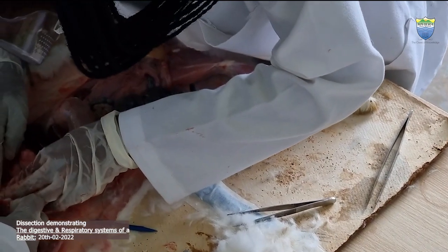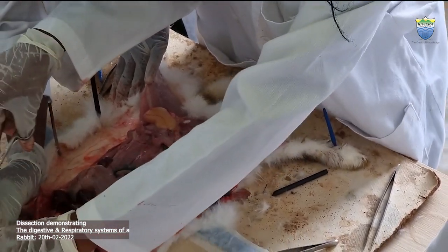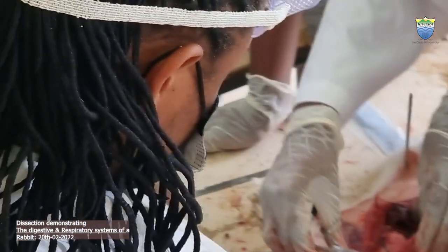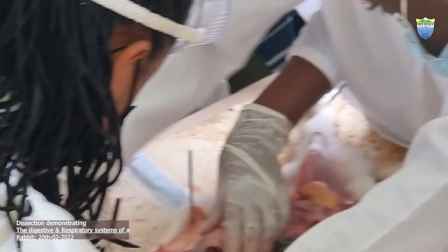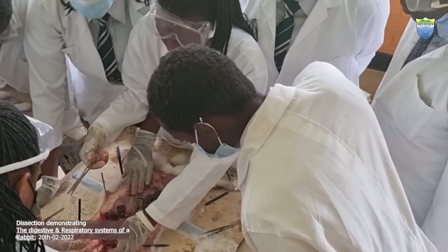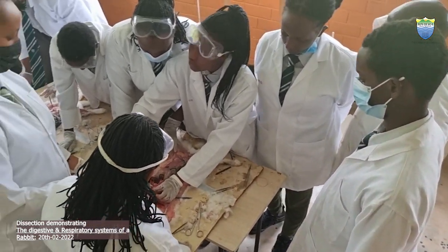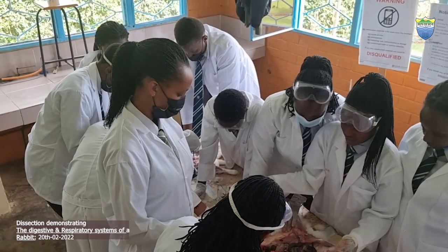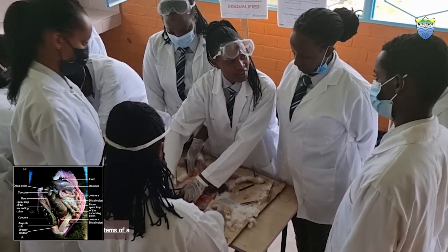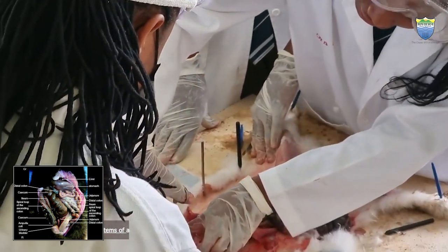For them, there are so many. One, two, three, four, five. The down ones are five. So 10 down and 8 up. In the incisors, two down and four up. So in total, how many teeth? 18 plus 6, 24. Because down there are 10, up 8, and this one 6. Can we cut this to see where the tooth starts from?